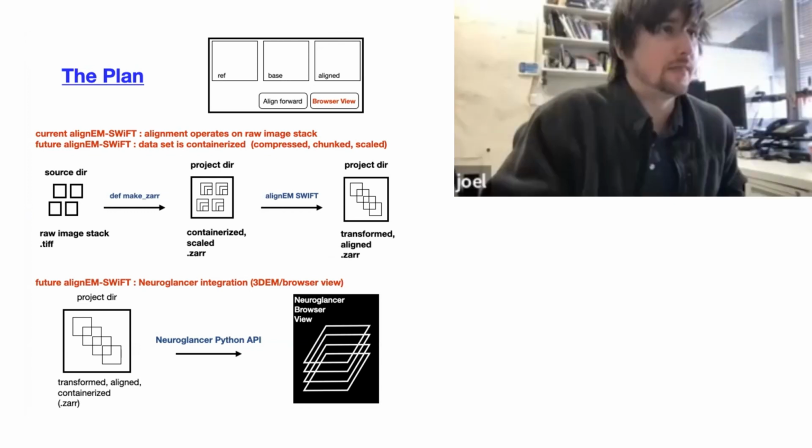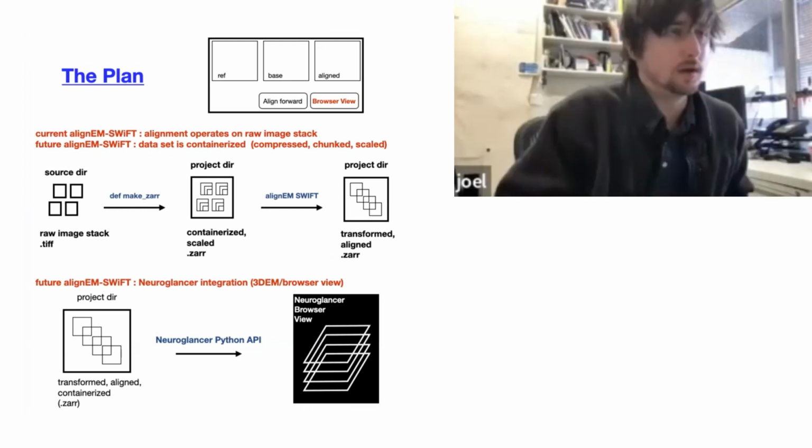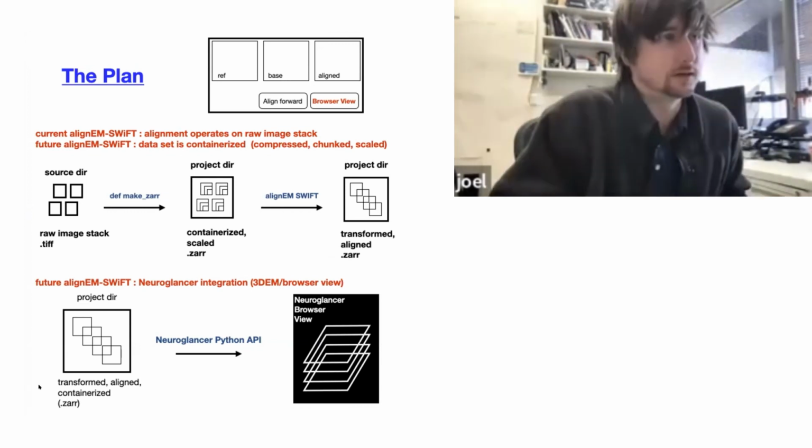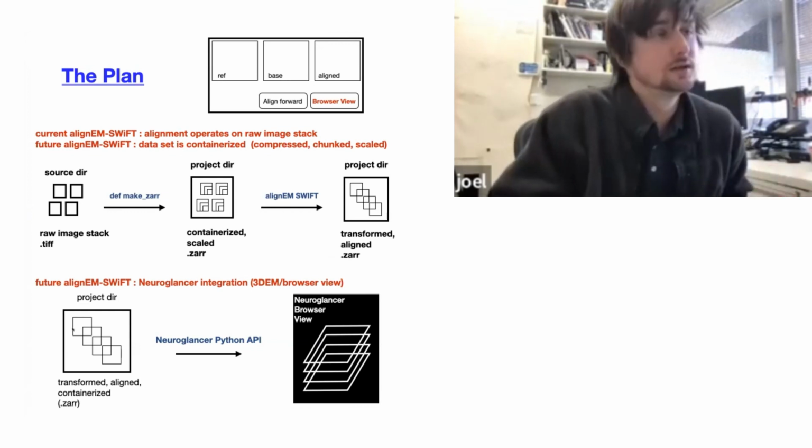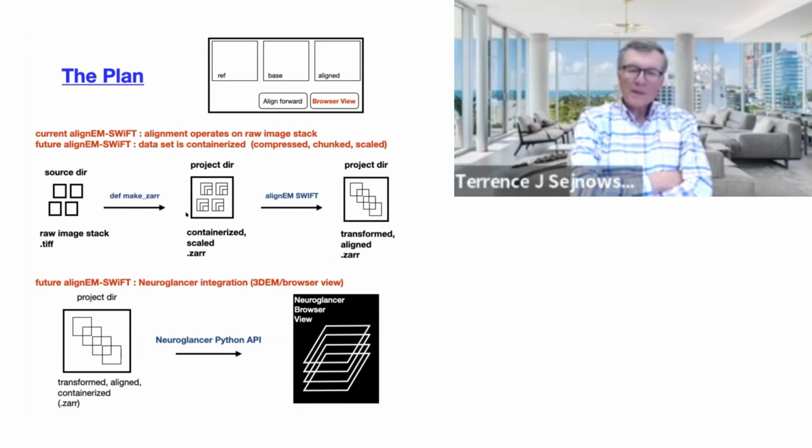Yeah, that could be in there, but that's not really along those lines. I'm thinking more the technical, like an image has EXIF data, as an analogy. So is it constrained to be only about the technical details of the image? I'm saying that this might be an opportunity to actually put animal data into it too, so that you could keep track of it.